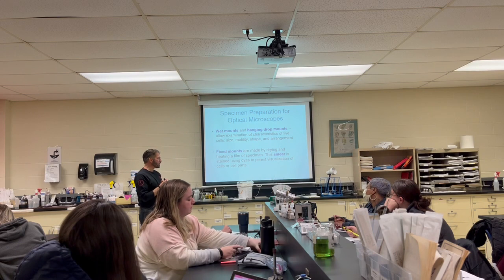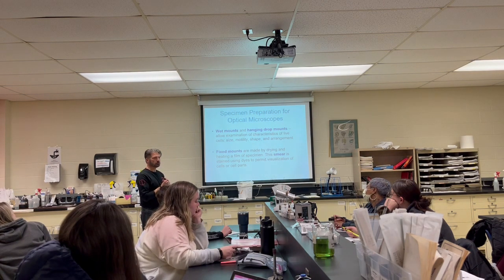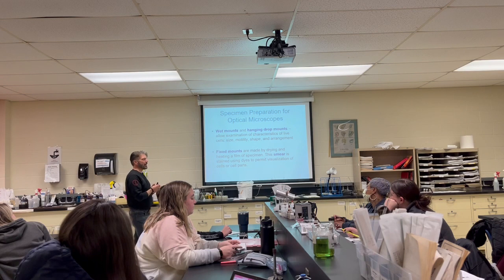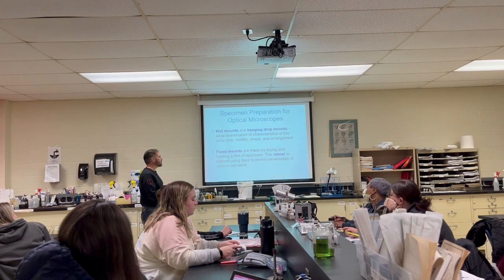Somebody had some mold on the plate, so it's going to be really large and filamentous, so it'll be easy to see. If you have some bacteria, it's going to be a little bit harder to see. We'll do that quickly tonight, if the weather holds up for us.